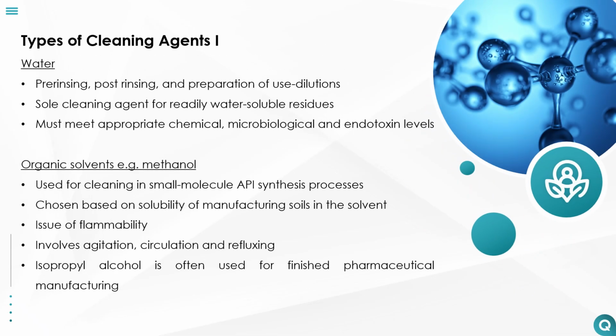Water is typically used in pre-rinsing, post-rinsing, and preparation of use dilutions. It can also be used as a sole cleaning agent for readily water-soluble residues. It must meet appropriate chemical, microbiological, and endotoxin levels.